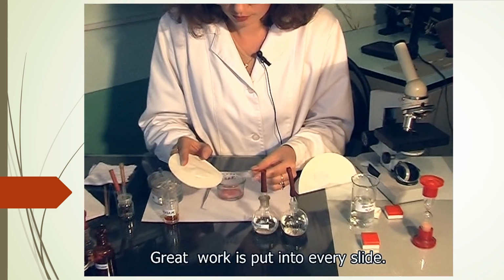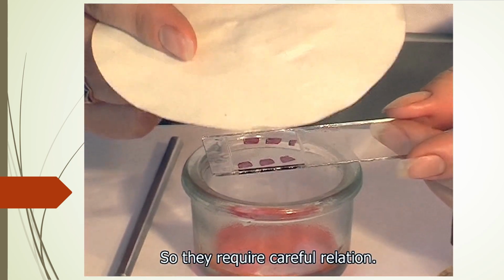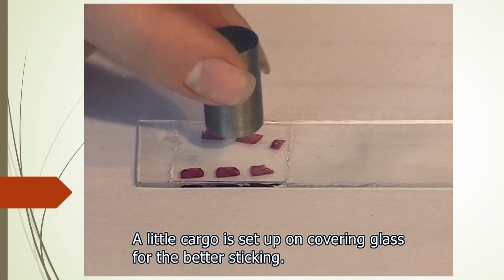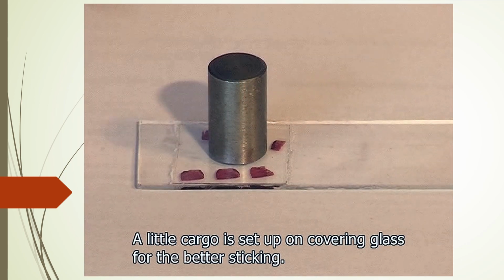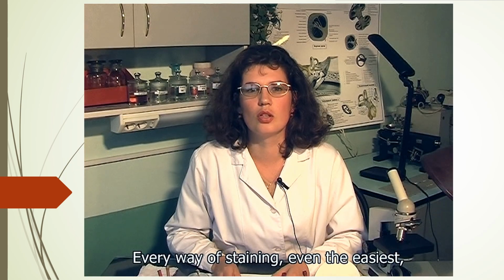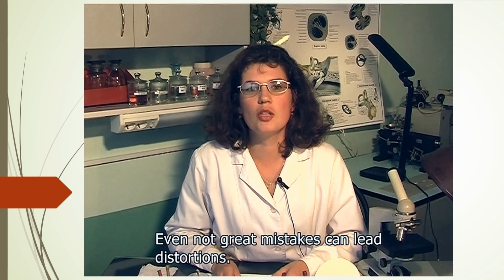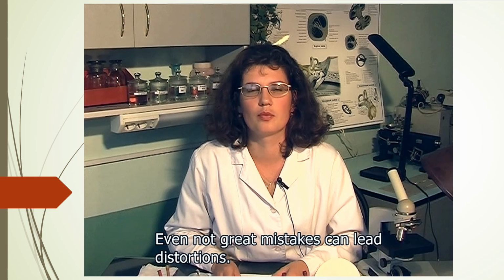Great work is put into every slide, so they require careful treatment. A little cargo is set up on the covering glass for better sticking. Every way of staining, even the easiest, demands exact observance of the making technology. Even small mistakes can lead to distortions.